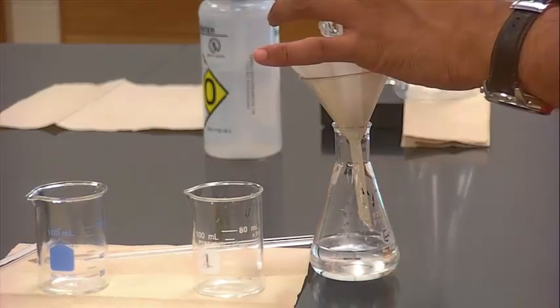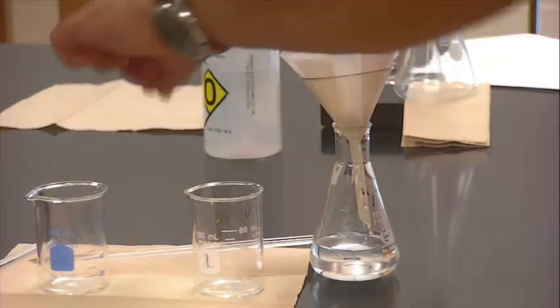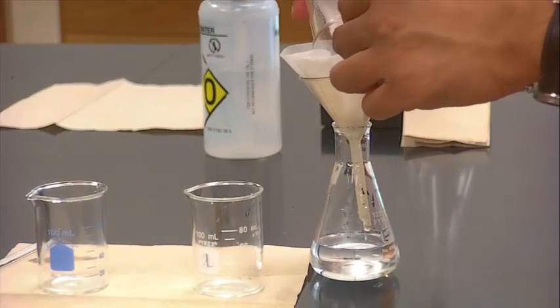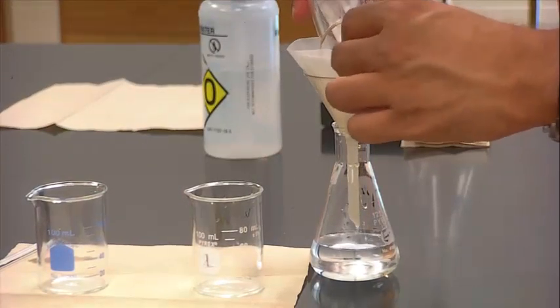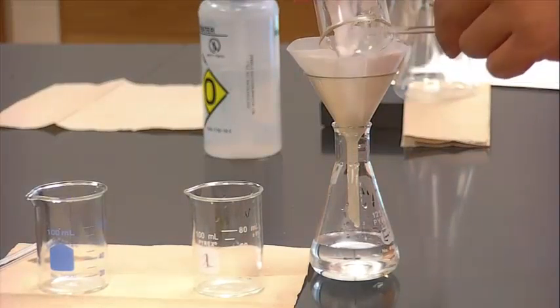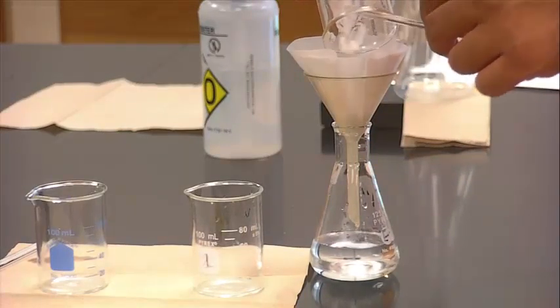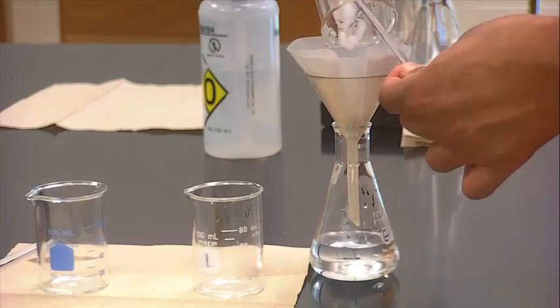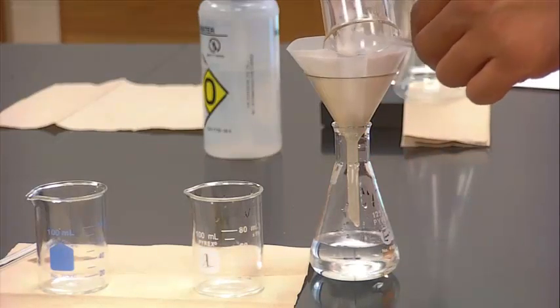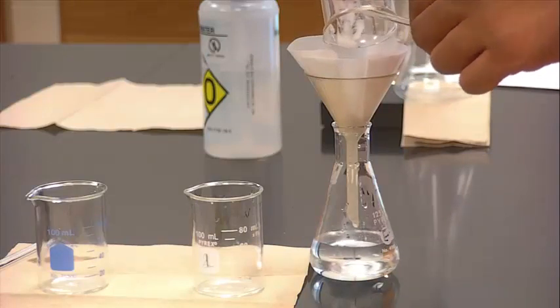If you have a spatula handy, you can use it to get the remaining part of this solid calcium iodate. So it's worth remembering that this is a sparingly soluble precipitate, so it's not 100% a precipitate.